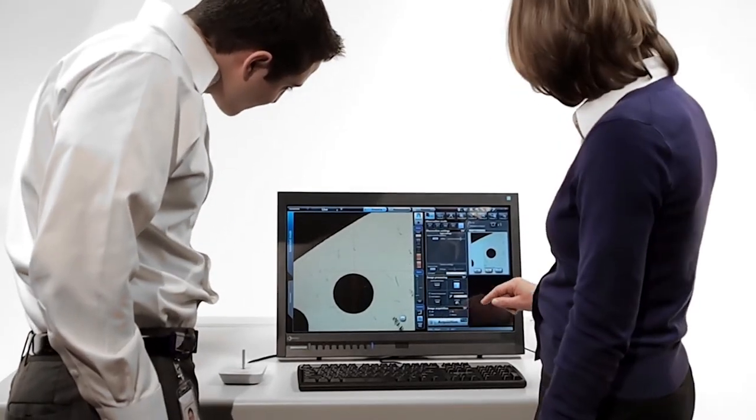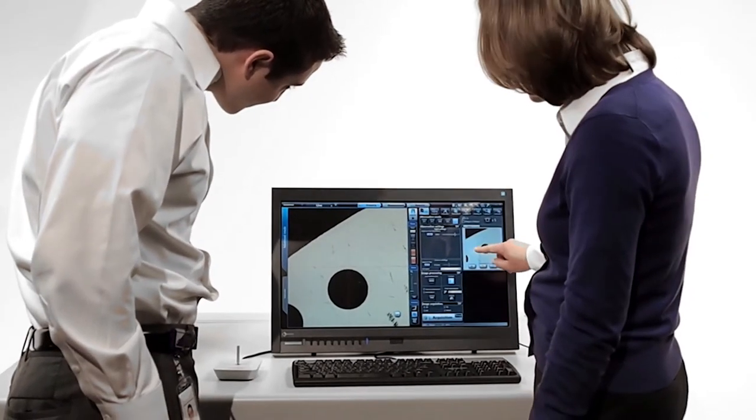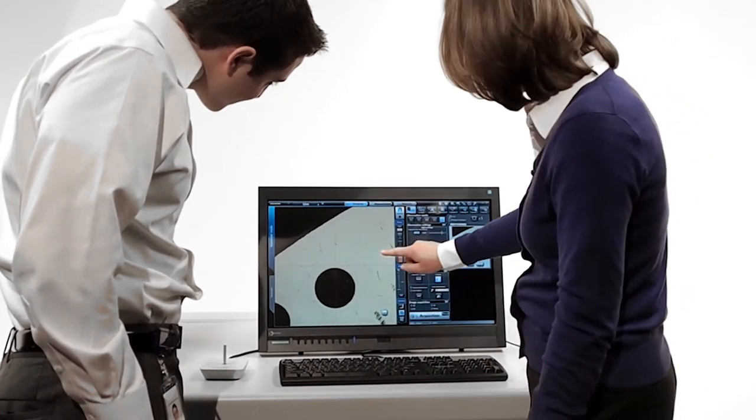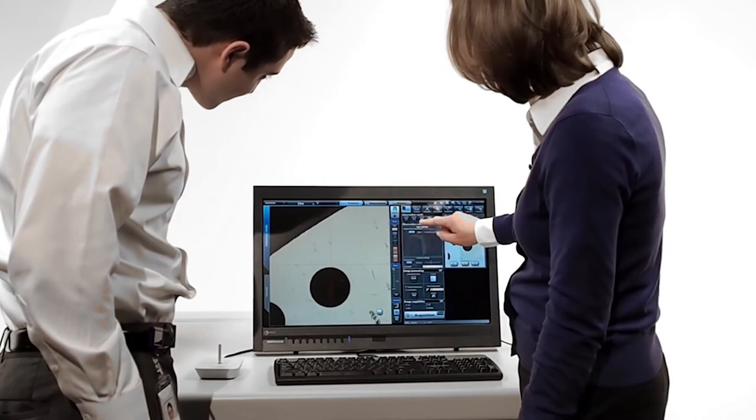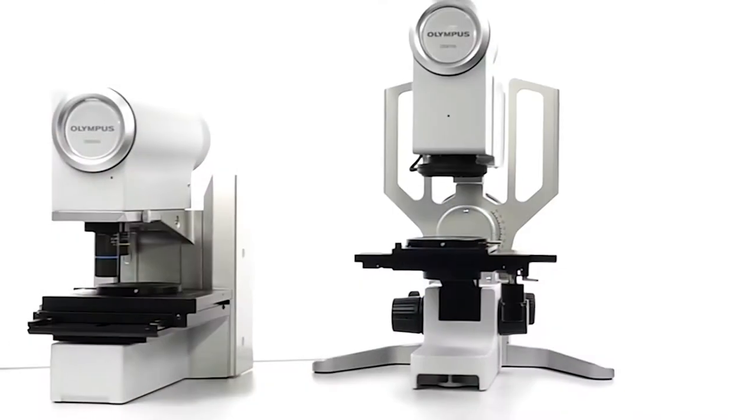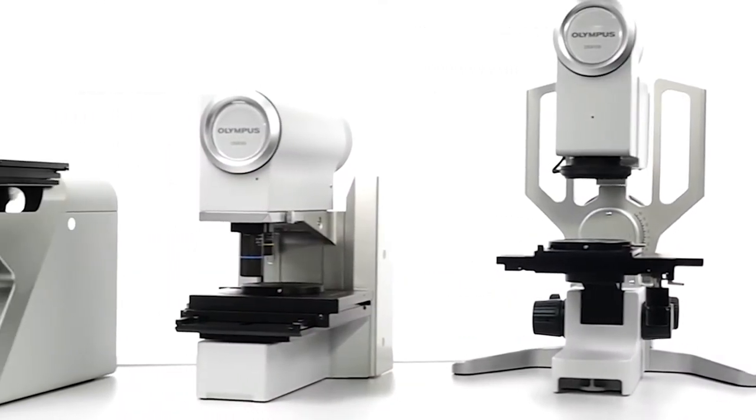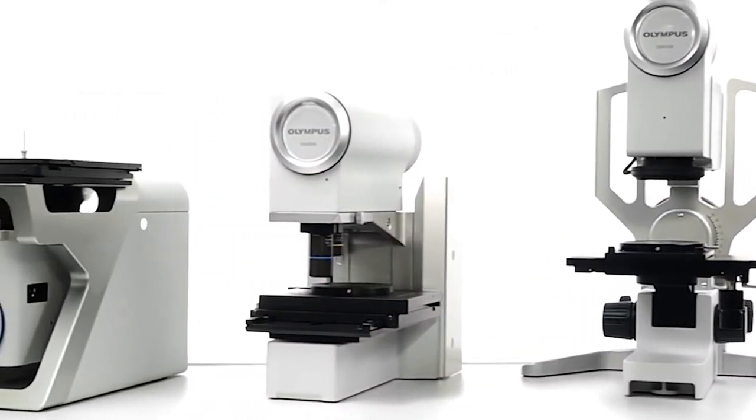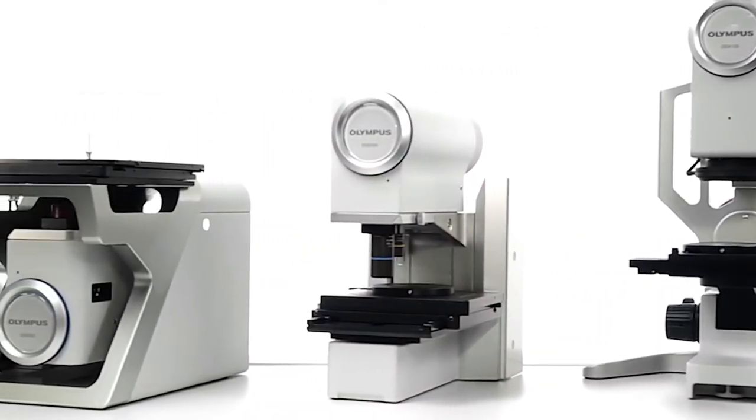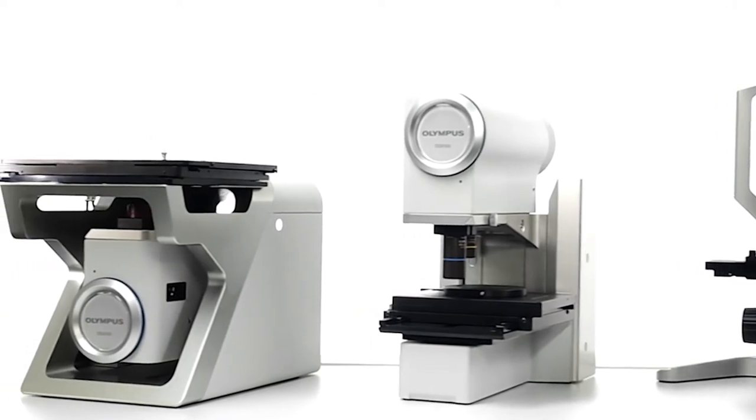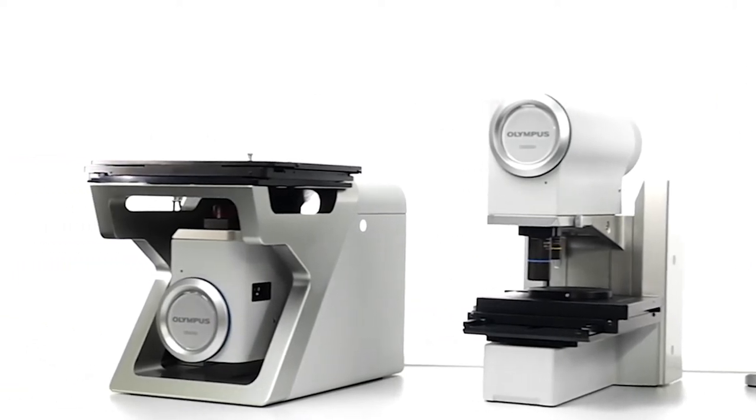Training is a snap, and because DSX series instruments offer proven Olympus reliability, you capture the best image and get usable data you can count on every time.